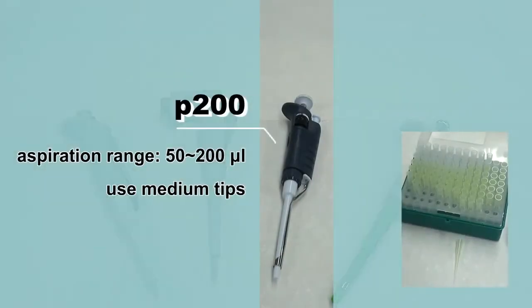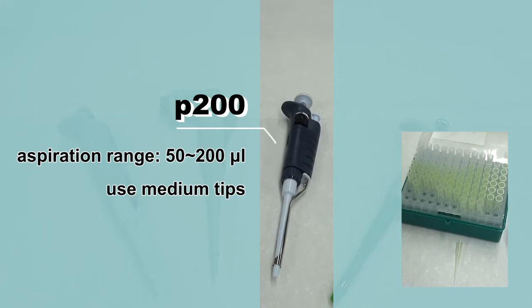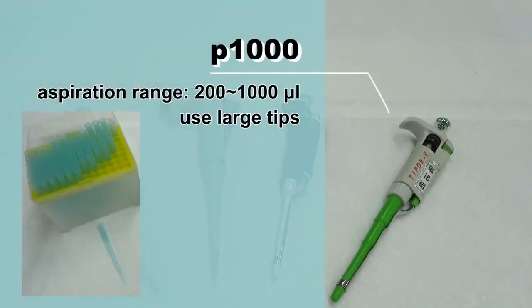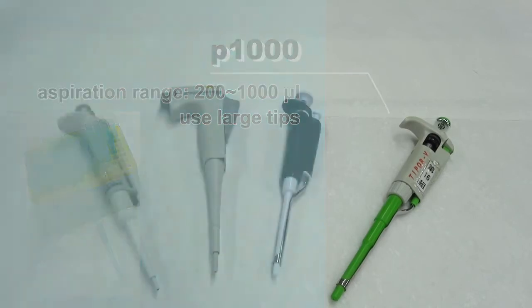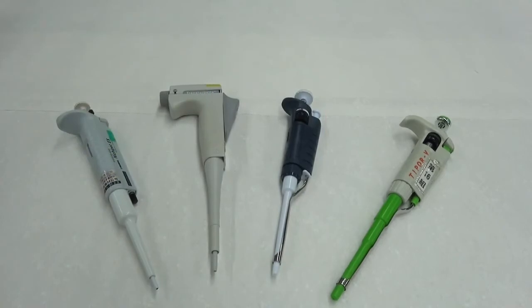The P200, which has an aspiration range of 50 to 200 microliter and also uses medium tips. Please choose the proper type according to the experiment.